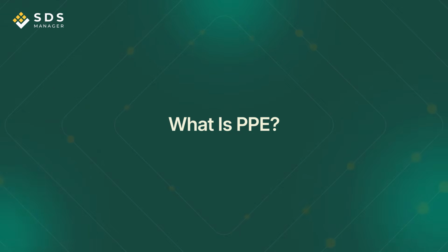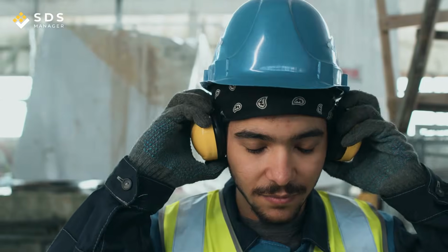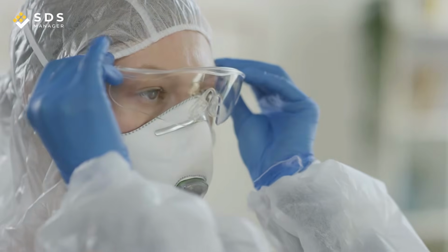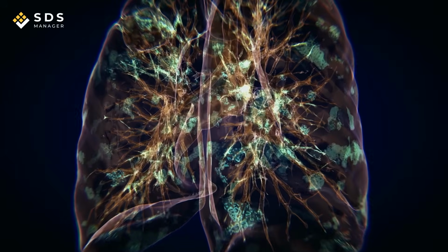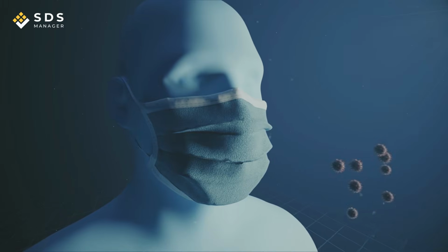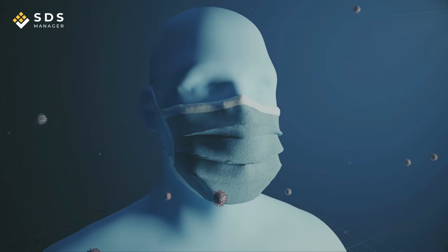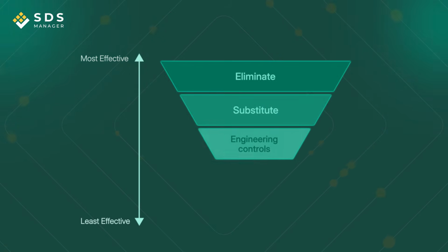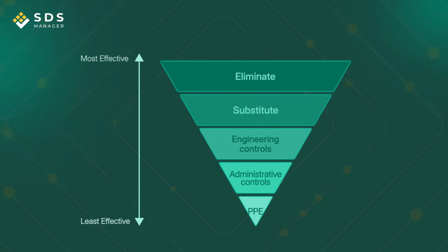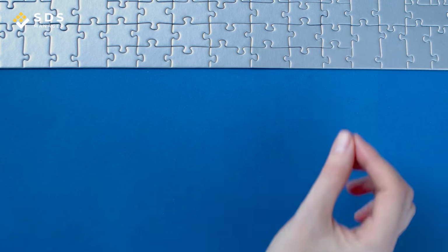What is PPE? Personal protective equipment refers to any clothing, device, or barrier worn by a worker to protect against a specific hazard. In chemical environments, PPE serves one purpose: to prevent hazardous substances from reaching the body. It does not remove or reduce the hazard itself. It places a barrier between the worker and the chemical. That's why it sits at the bottom of the hierarchy of controls, below elimination, substitution, engineering controls, and administrative controls. PPE fills the gap where other controls aren't sufficient or aren't yet in place.